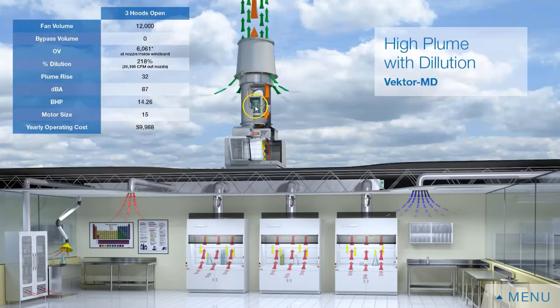This is a direct drive where the motor and impeller are directly attached. There is also an isolation damper below the fan so when the fan is shut off, air can't go backwards into the system.